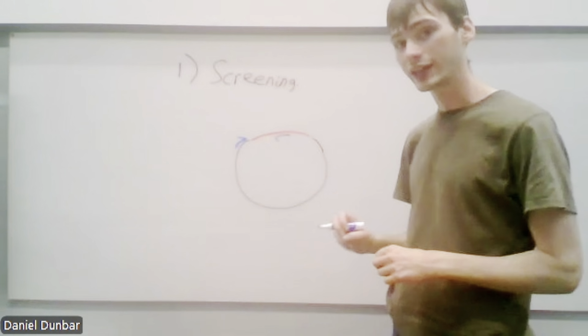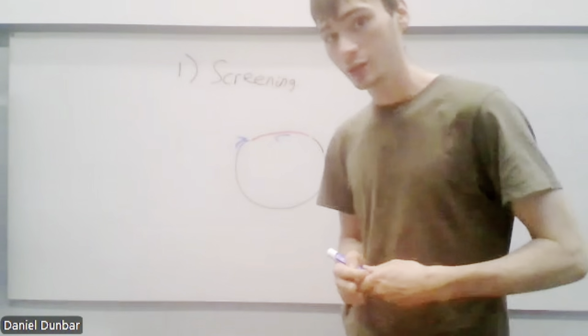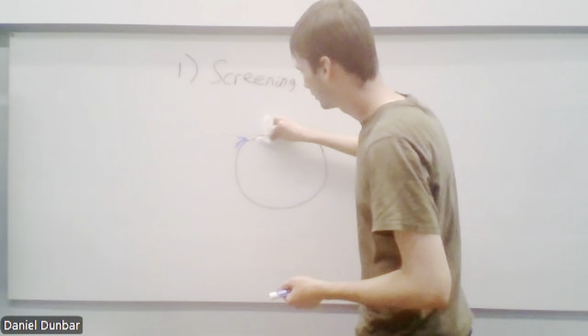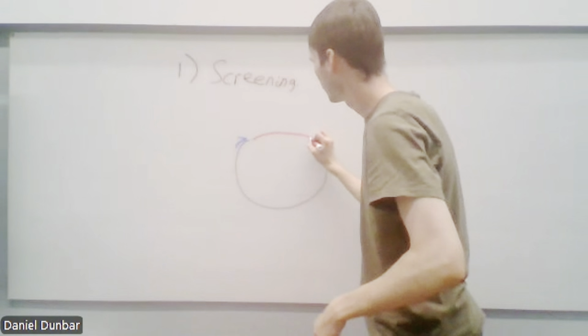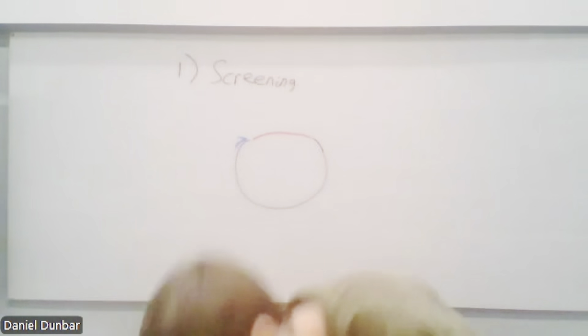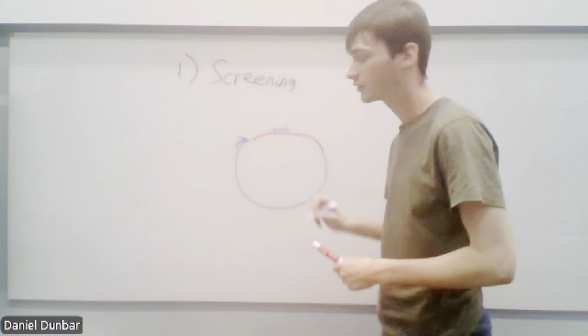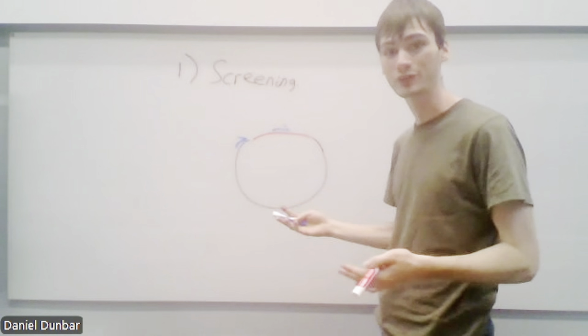And this should only amplify if the insert is in the correct way, because if the insert is in the wrong way, then the insert specific primer ends up annealing there, and that's not amplifiable. There's no amplification that will occur.